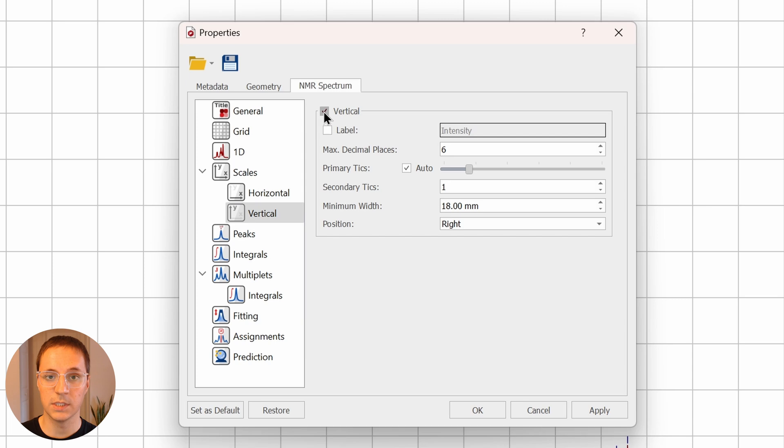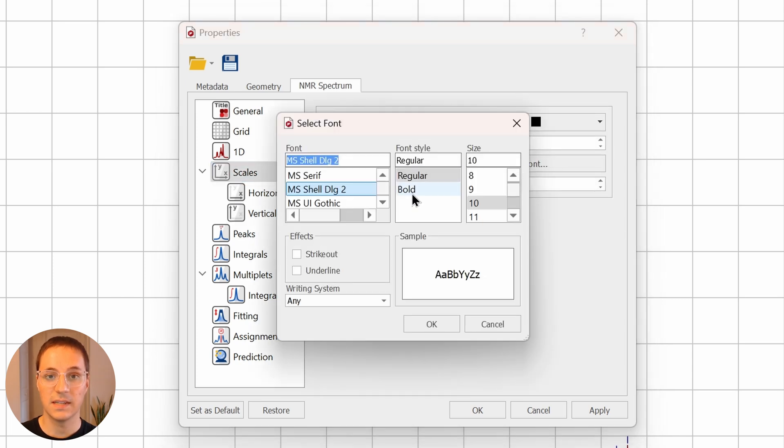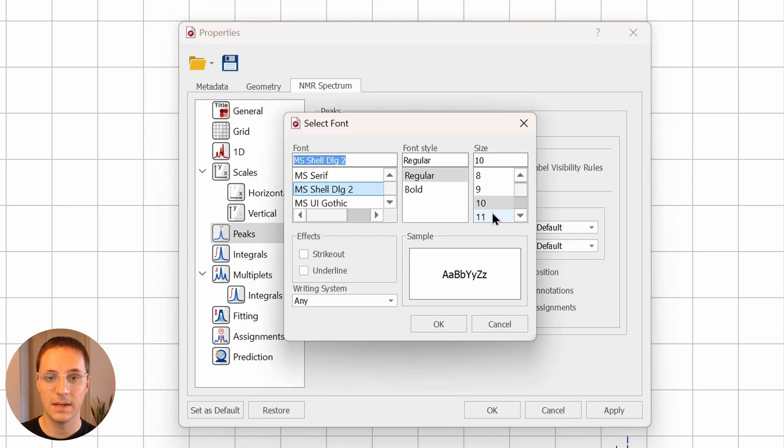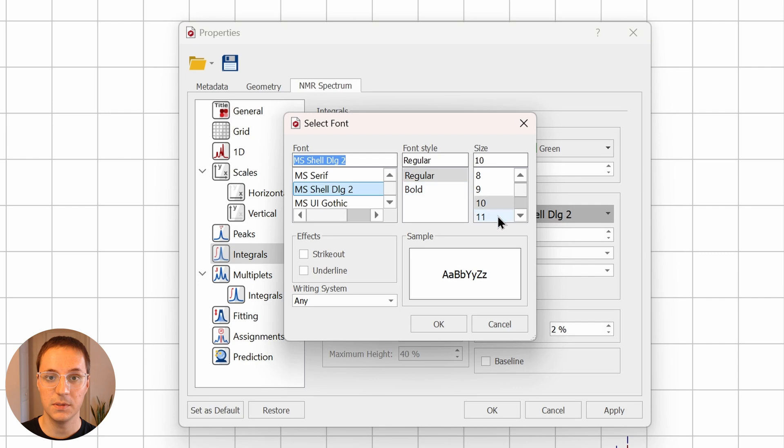Remove the vertical scale, change the label on the horizontal scale, increase the axis label font size, and change the font size on both the peak labels and the integral labels.